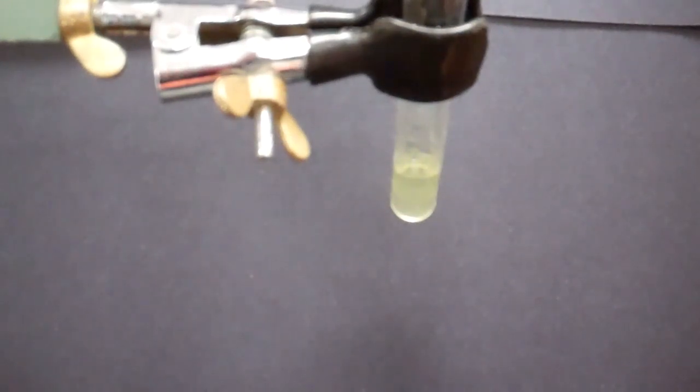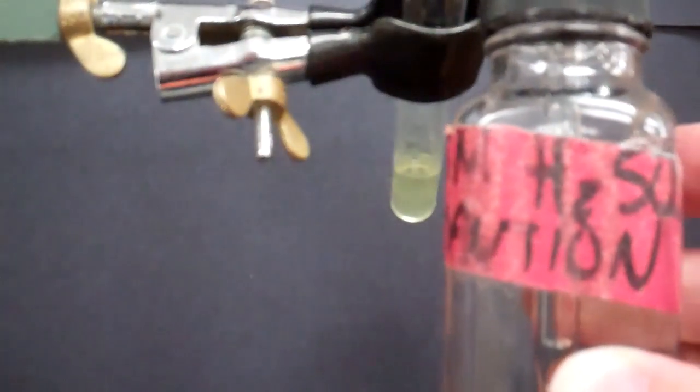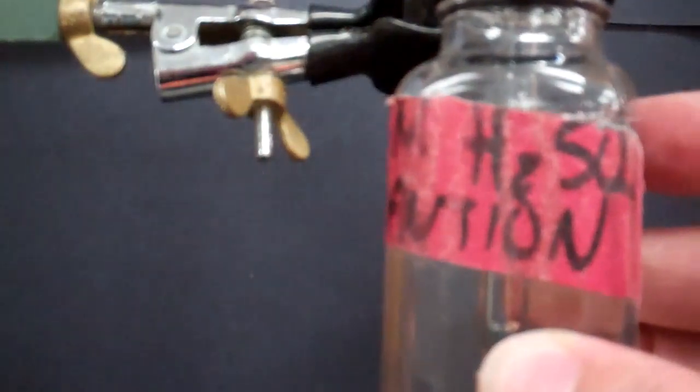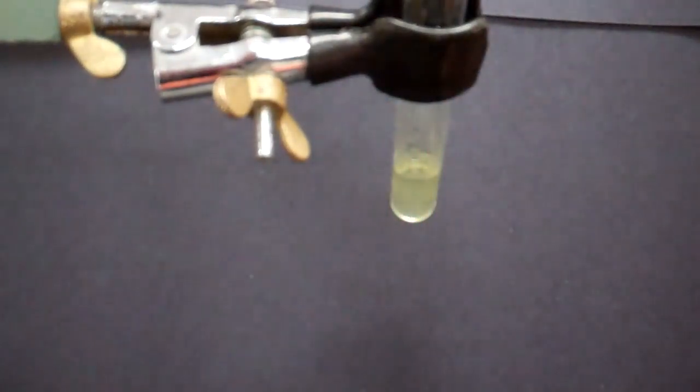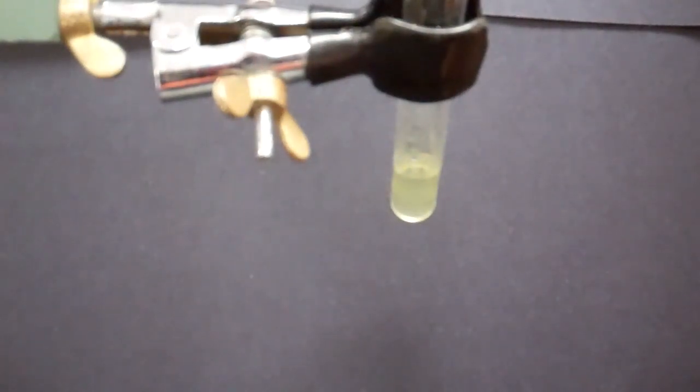In this next step, we're going to be adding 18 molar sulfuric acid located in these dropper bottle pipettes. This is a very strong concentration of this acid, so you want to be extra cautious when you are using this dropper.